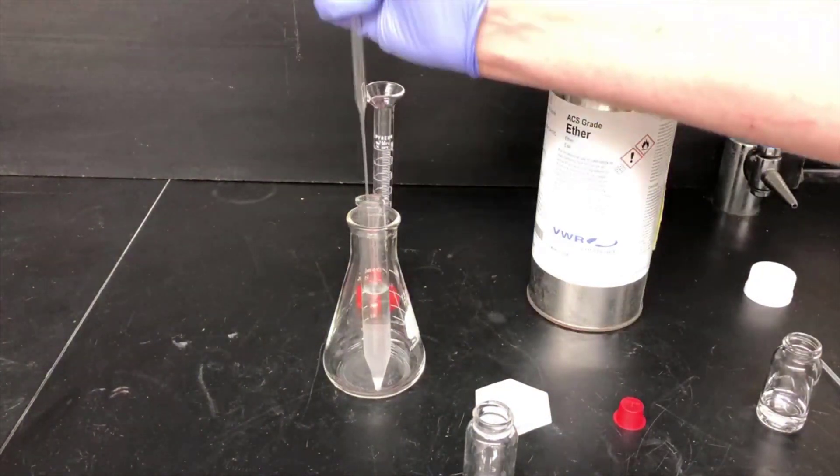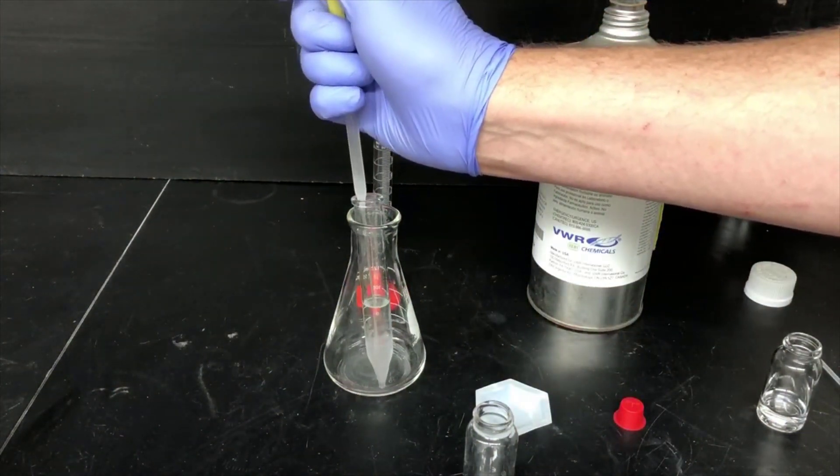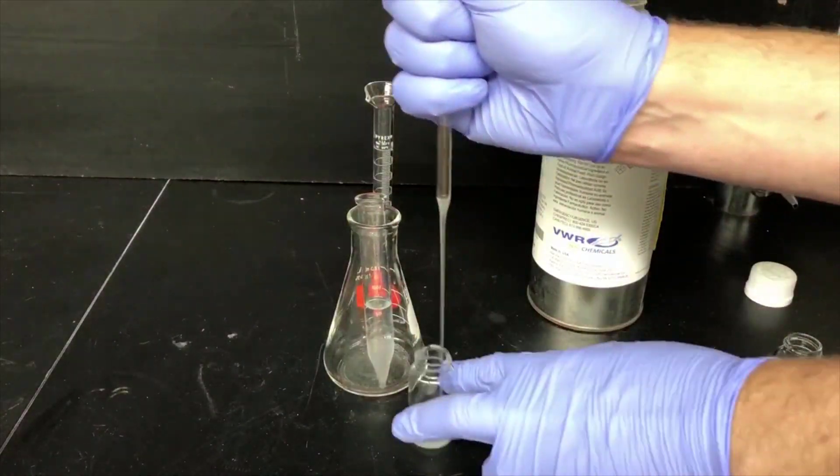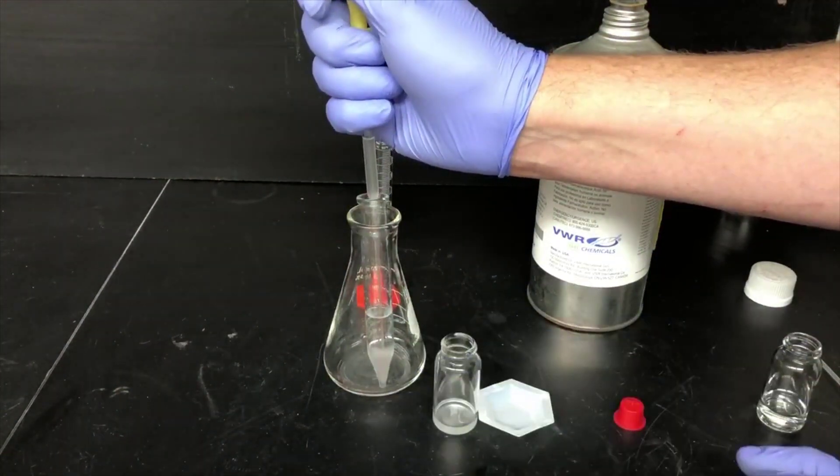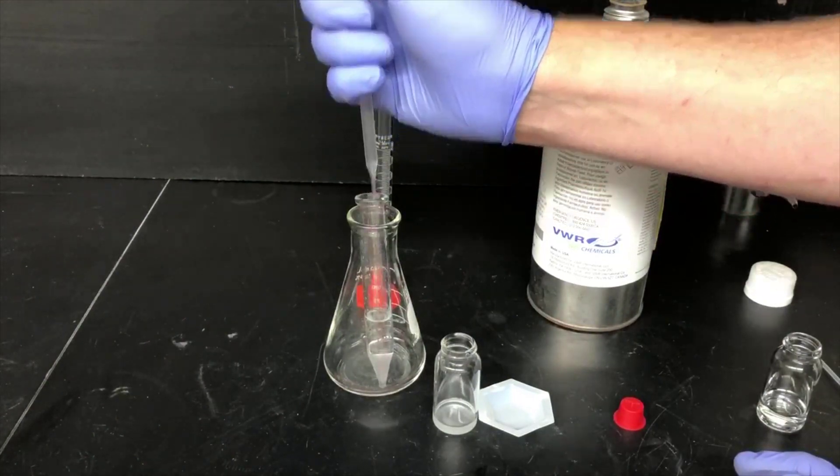I'm separating the bottom layer by putting a pipette down to the very bottom of the tip and sucking out that layer. It's always easiest with these point-bottom test tube extractions to suck out the bottom layer first, even if the top layer is the one you want.